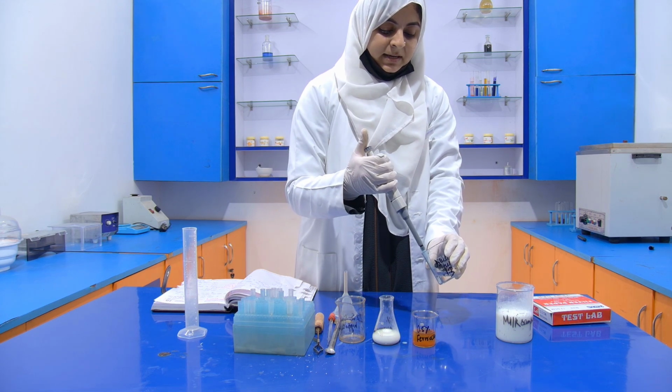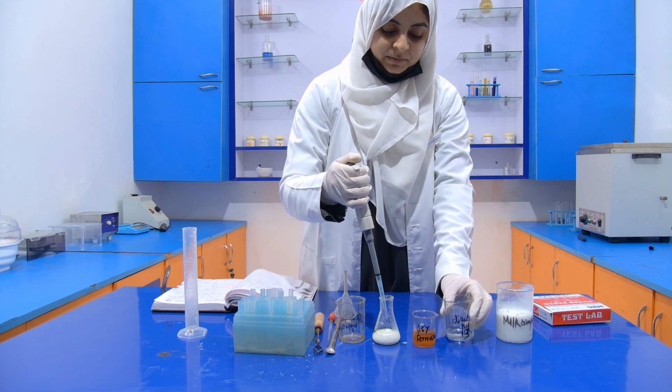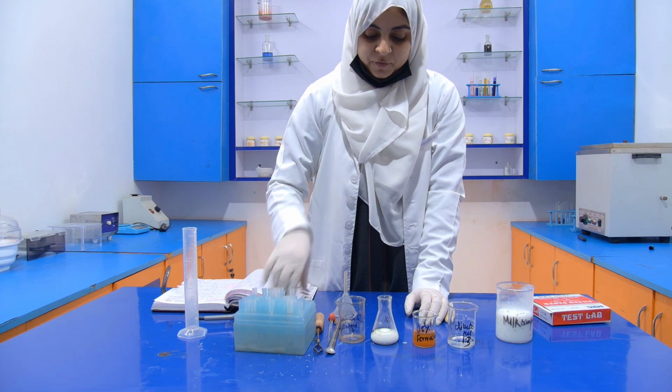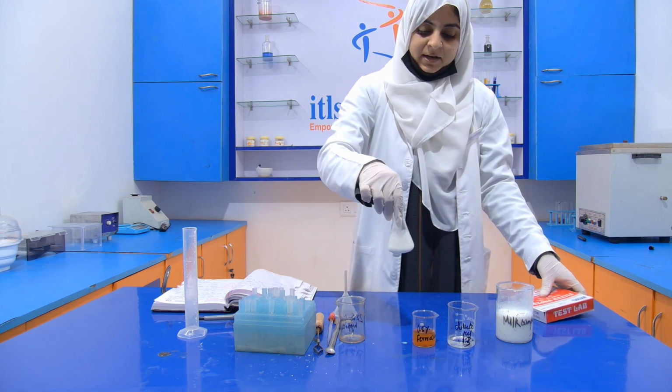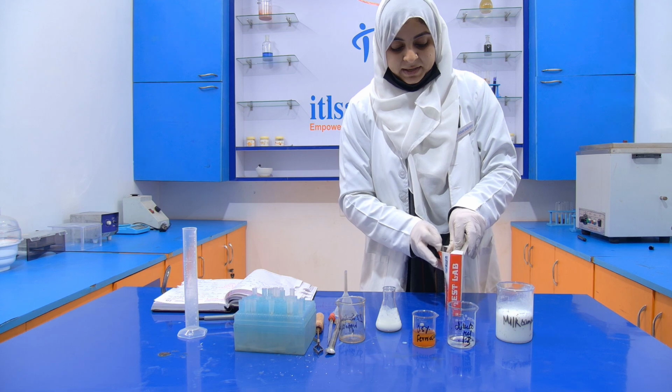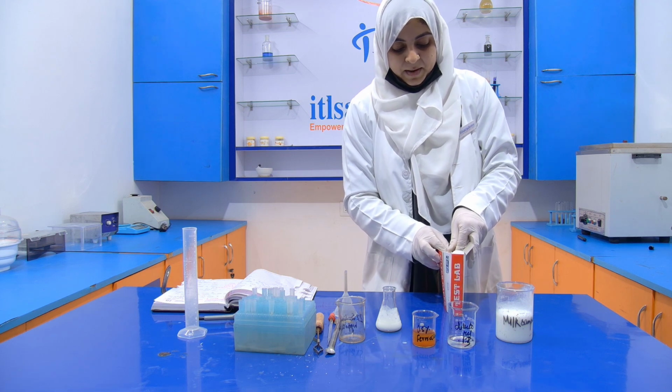This dilute HCl is added for the acidification. Now we have to mix it properly because curd is formed. After that, we have to filter it using a filter paper.